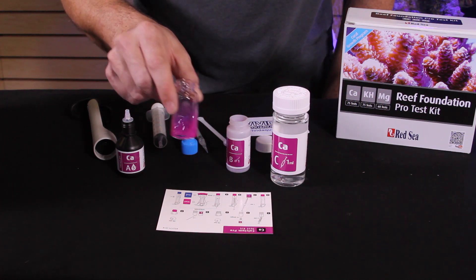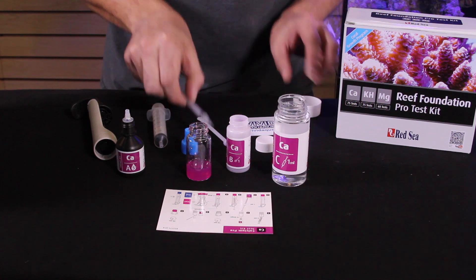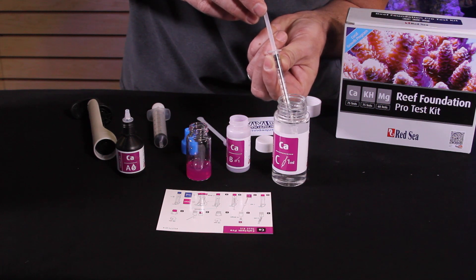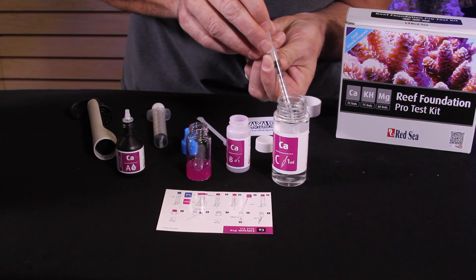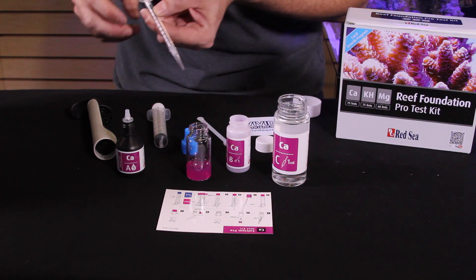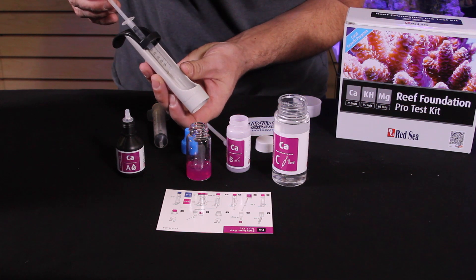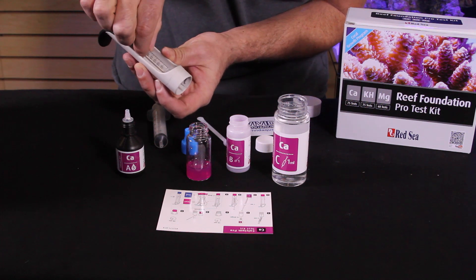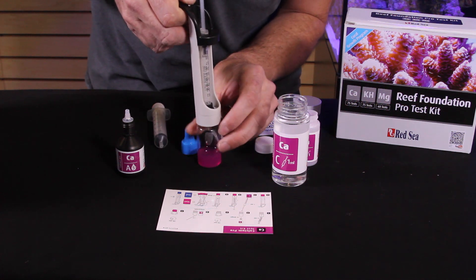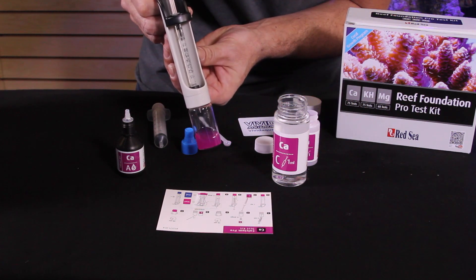The last step is a titration reagent. We'll need to draw 1 milliliter of reagent C into the syringe, with the stopper right at 1 milliliter. You'll have a little air gap at the top, but that's compensated for by reagent in the tip of the vial. Red Sea has provided a holder for the syringe — be careful not to press any reagent out. The test vial actually screws onto the bottom of this holder, and we're looking for a color change from pink to blue.